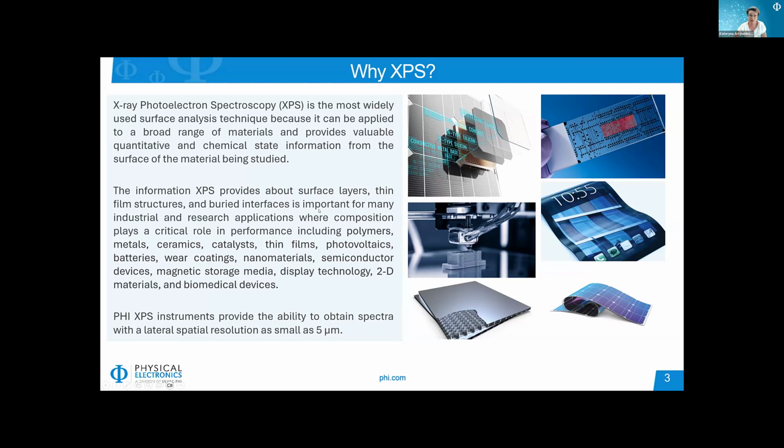Depending on the instrument, you can analyze a variety of different sizes on the sample, from a large area to as small as 5 microns on some XPS instruments.